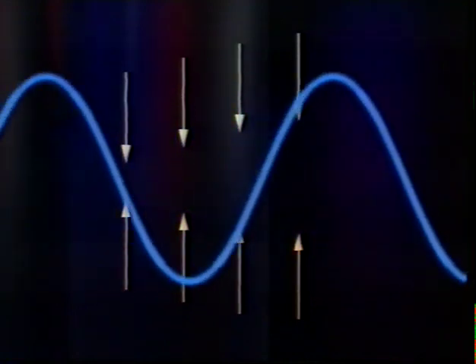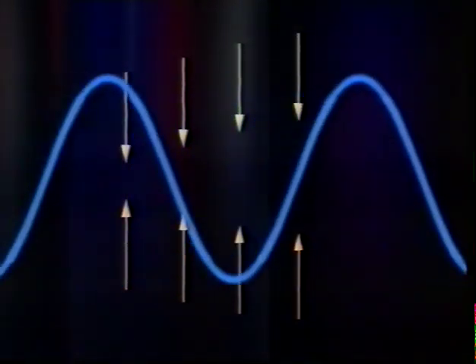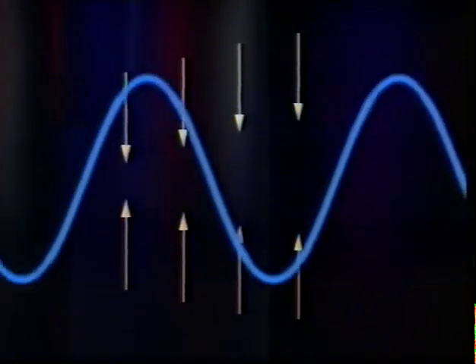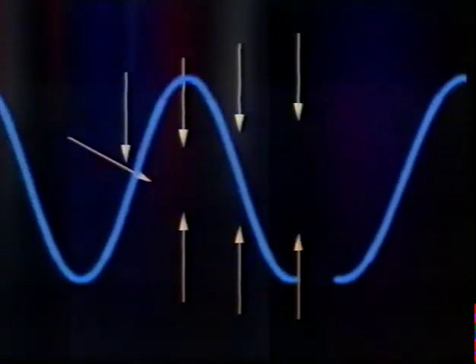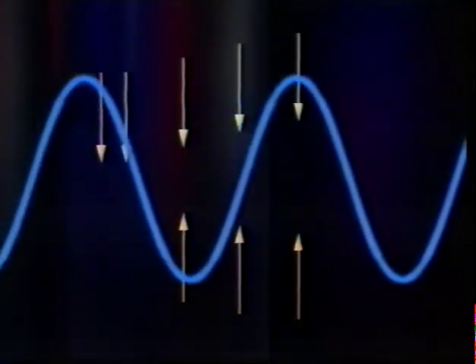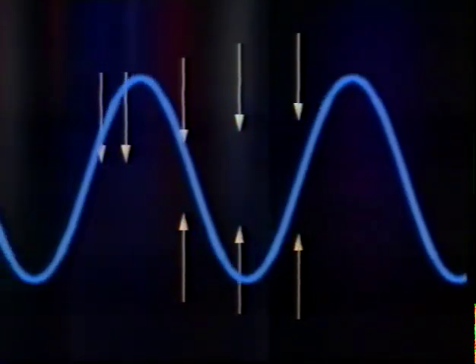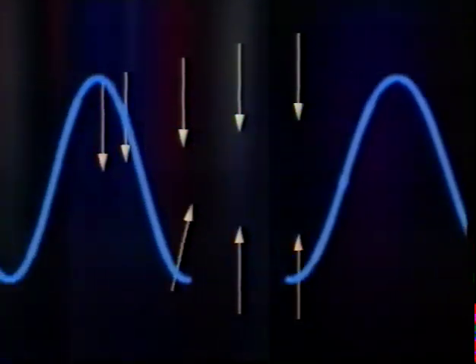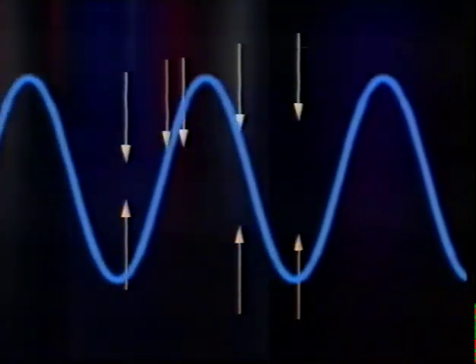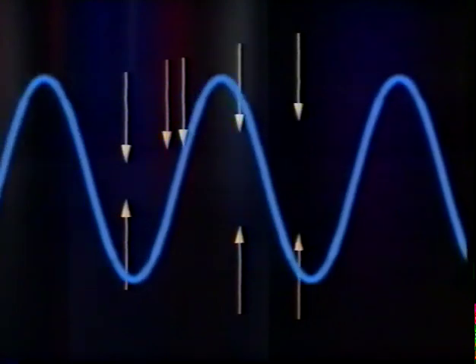When the spectrometer generates exactly the right frequency, and this hits a particular proton, it absorbs some of the energy, causing it to flip from one level to the other. This condition is known as resonance, and it is this that the NMR spectrometer detects. The bigger the energy gap, the higher the frequency needed for resonance.